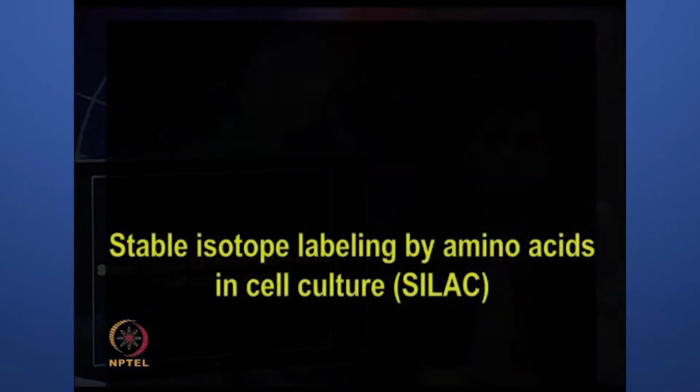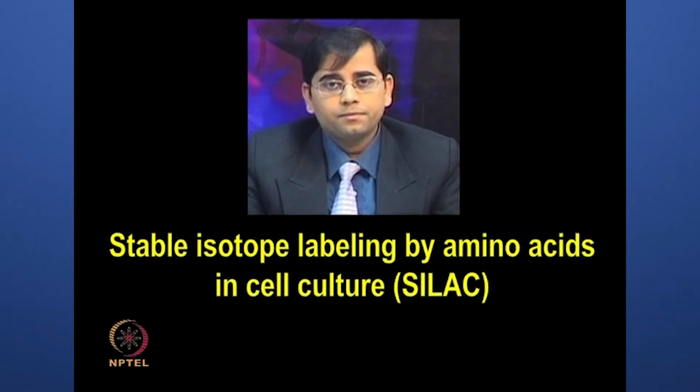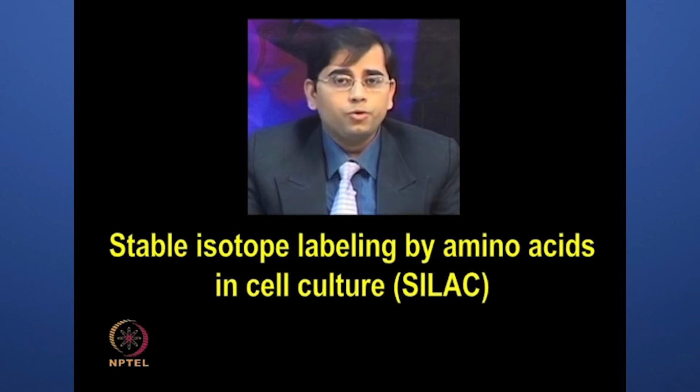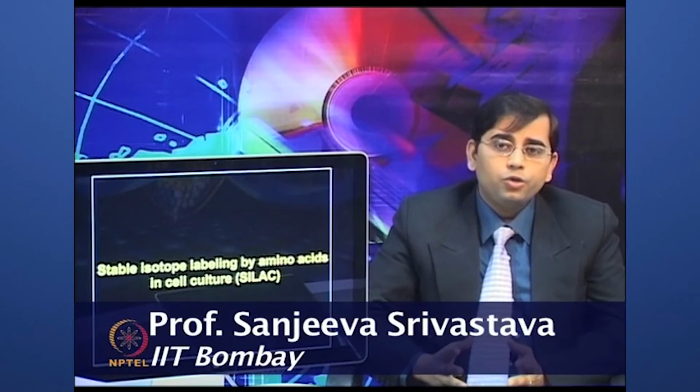After having discussed some of the less commonly used methods such as 15N media and CDIT, now let us discuss stable isotope labeling by amino acids in cell culture, SILAC. So, MS based quantitative proteomics is an increasingly popular approach to study changes in the protein abundance in various biological samples. SILAC, which is a metabolic labeling strategy to encode the whole cellular proteome, is one of the very widely used methods for quantitative proteomics.